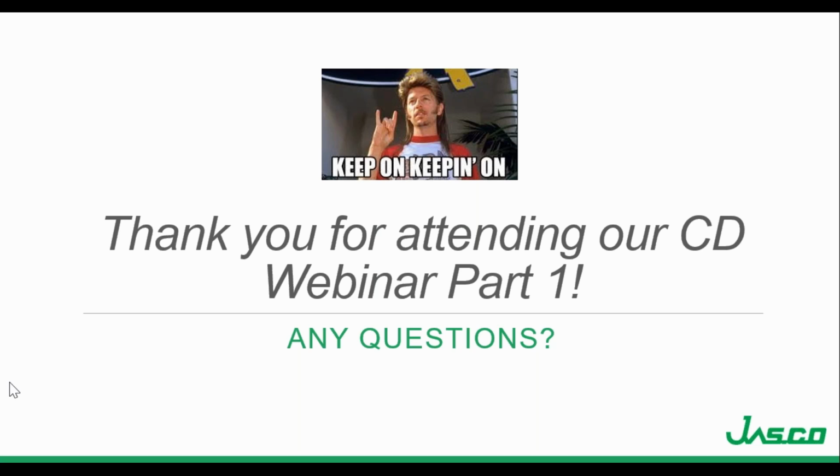Is there a relationship between the signal detection and the wattage of the lamp? So no. This is something I'm going to go into in the next webinar about the HT voltage and how that accommodates for fluctuations in light level.